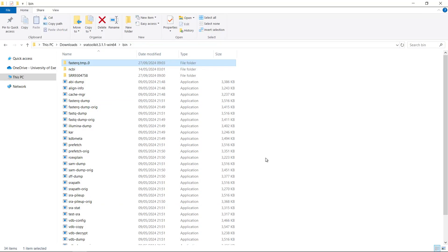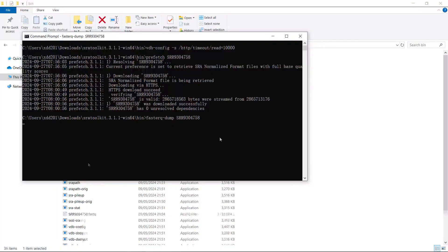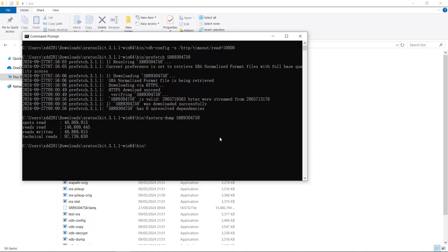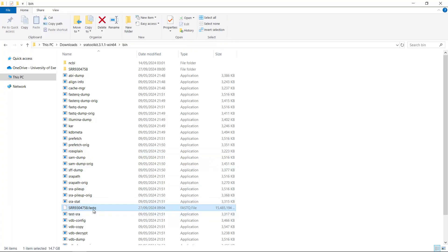Going back to the command shell, you can see it is still running. We have now finished the file extraction. You can see the read count and write statistics in the output. In the folder, the temporary folder has disappeared and we have a FastQ file for this sequencing dataset. We have successfully downloaded the FastQ sequencing data from NCBI.